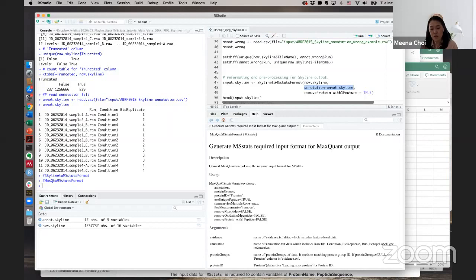Internally, the MSstats team is refactoring the MSstats package. This is one of the big reasons: we want to make it more RAM efficient and faster for bigger data sets. Hopefully we can make this happen for the next release, which means this October.